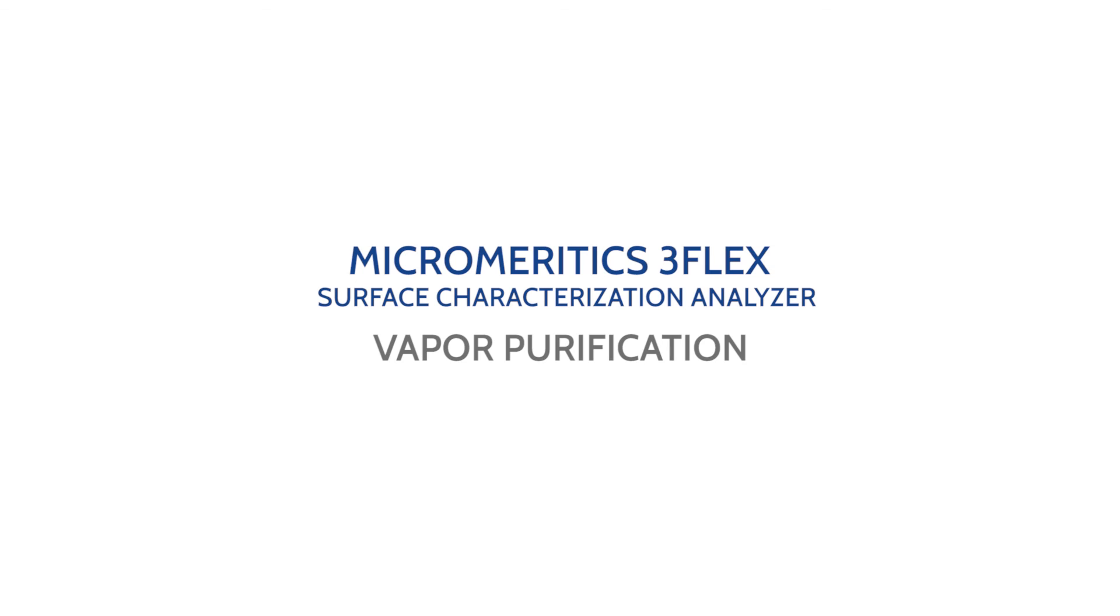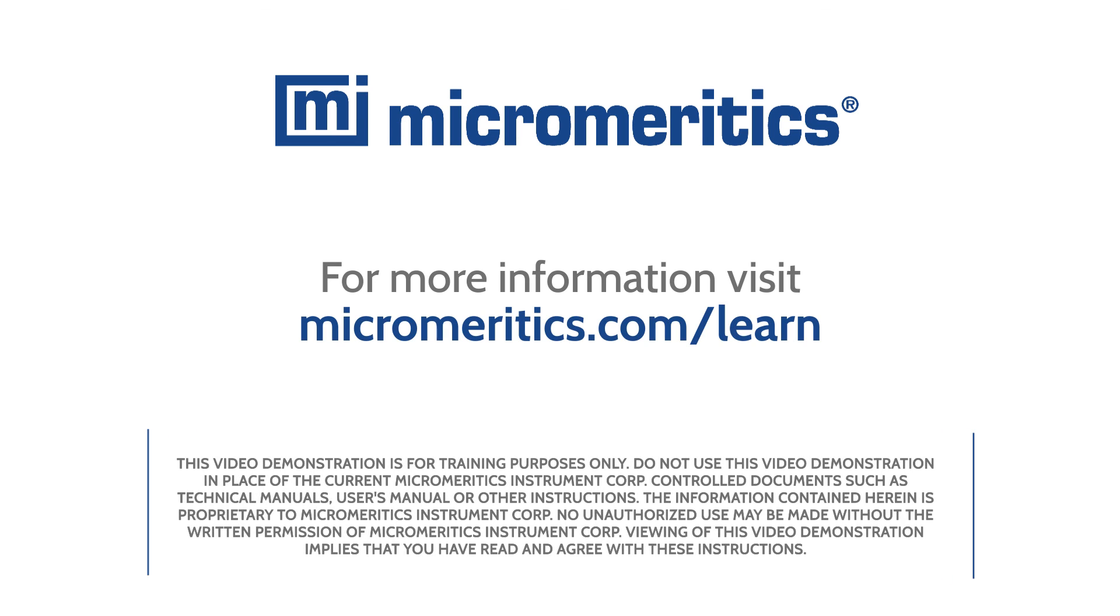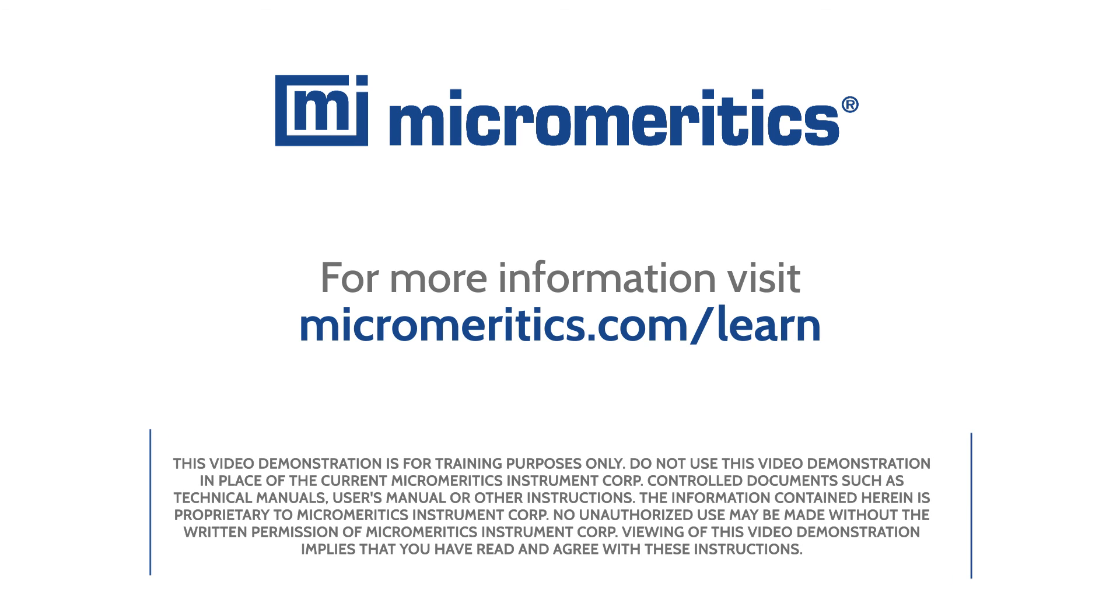Now you are ready to use the Micromeritics 3-Flex surface characterization analyzer for vapor analysis. For more information, visit micromeritics.com/learn.